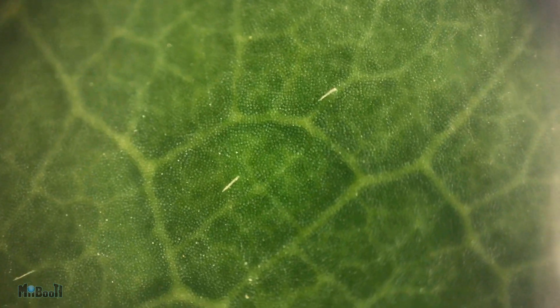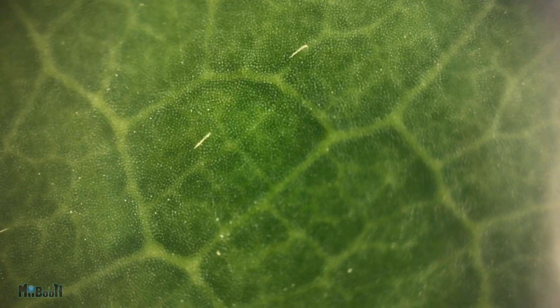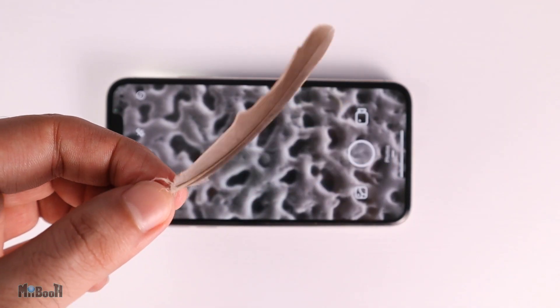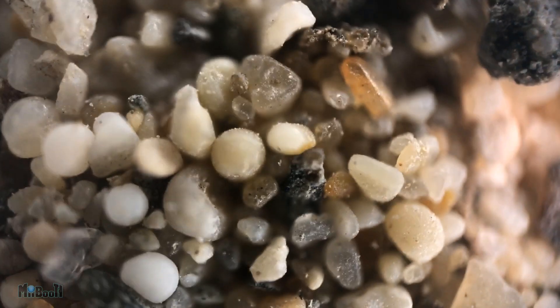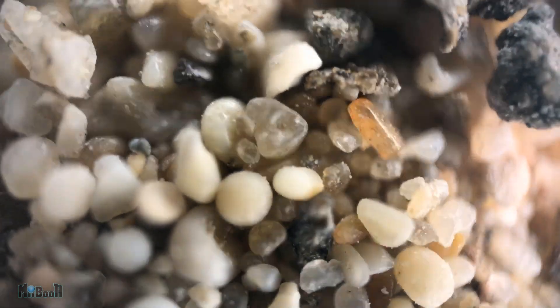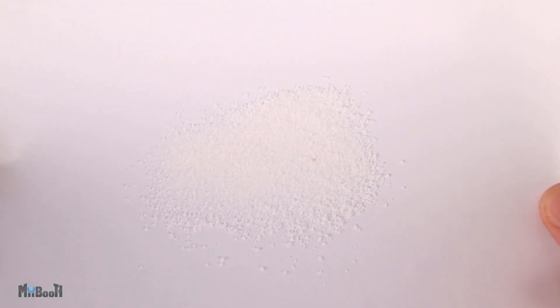The lens has a very shallow depth of focus, so it's easier to view flatter objects rather than ones with a lot of depth like insects. Here is a green leaf, and here is a dry one. Here is a dove's feather. What's next — how about some sand particles, or salt?